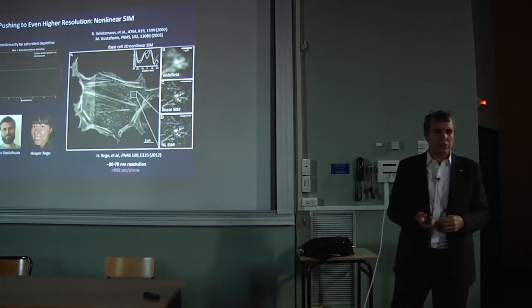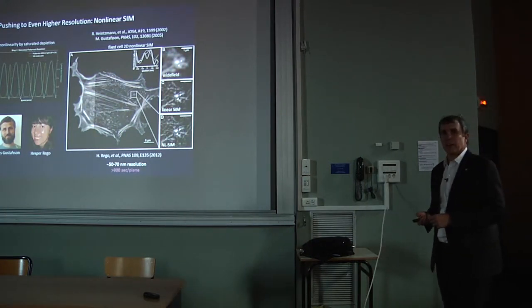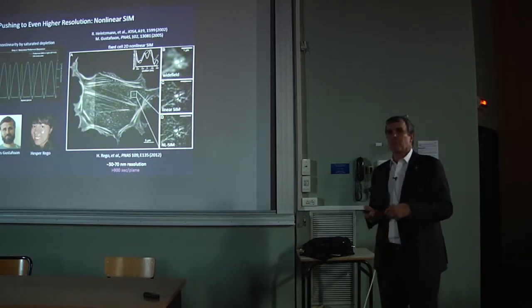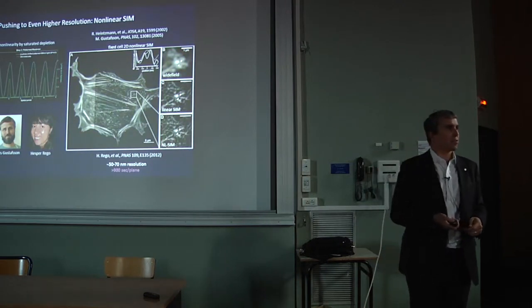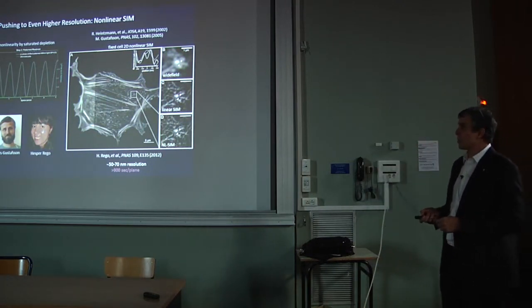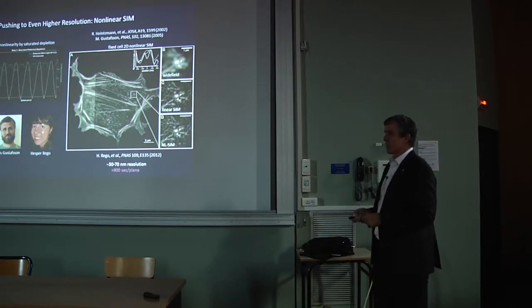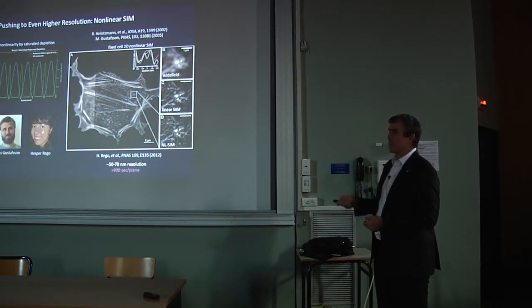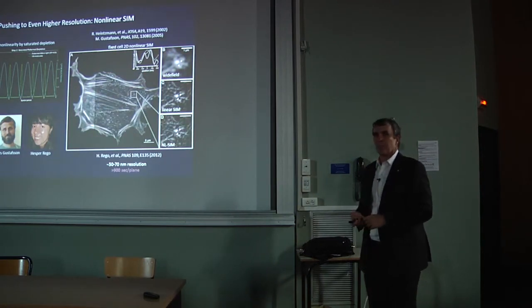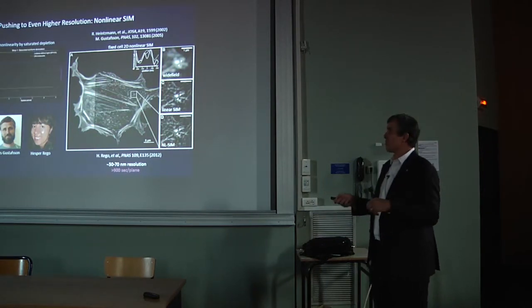So we described how to use high NA to get to near 80 nanometer resolution, but what if we wanted even higher resolution? Then we need to resort to these photo-switching tricks, which are the basis of PALM, STED, and RESOLFT. Similar to the RESOLFT technique that Stefan Hell developed, one way to do it is to take a photo-switchable fluorescent protein, first turn your violet light on to activate all of those molecules, and then come in with a standing wave, which can deactivate all of the molecules except the few that reside at the nodes.